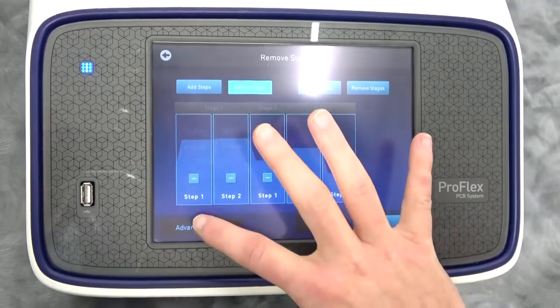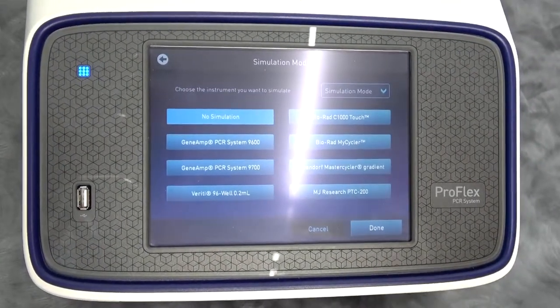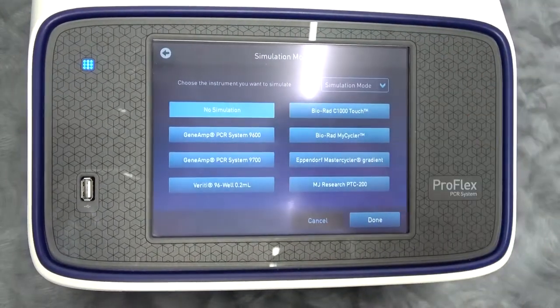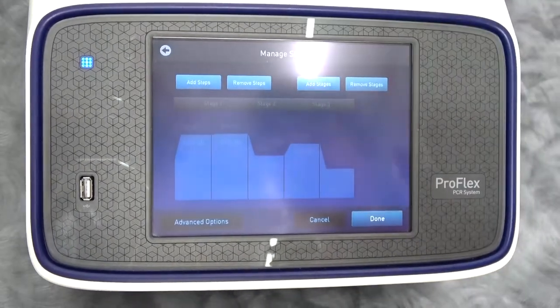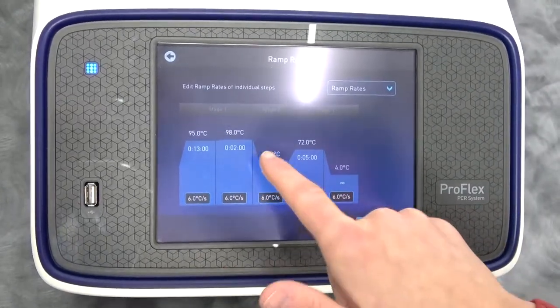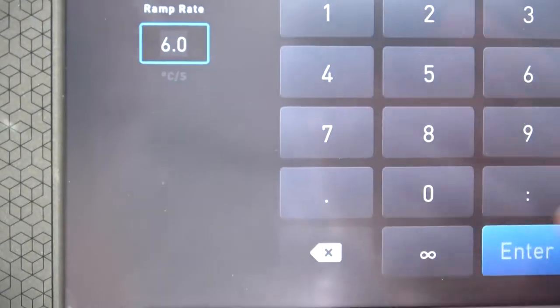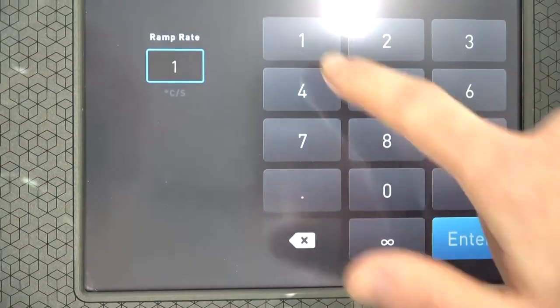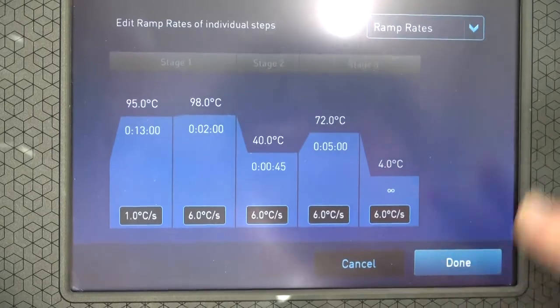You can also get into advanced options. Advanced options allow you to simulate another thermal cycler, meaning it's going to simulate the ramp-up speeds of whichever thermal cycler you choose — that's pretty cool. There are some restrictions based on what block you're using. Another cool feature is ramp rate: you can change the ramp rate leading into each step of your stage. The maximum ramp rate is 6°C per second, and you can change it down to 1°C per second if you want gradual changes.